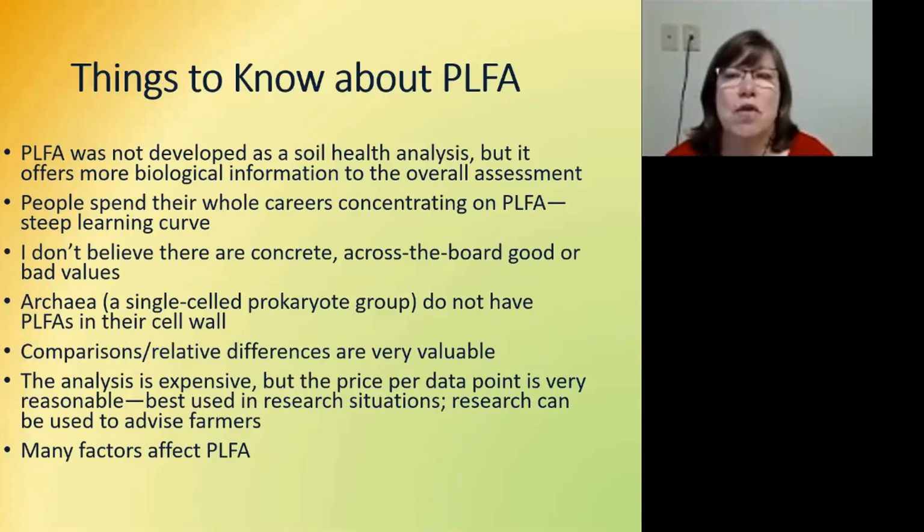Now, other things to know about PLFA. It was not developed as a soil health analysis. A lot of it was started about 30 years ago, more as a soil biology assessment. But I think there are a lot of reasons why you can use it. It does give us more information about the microbes, and through looking at it, we can learn about what is going on in the soil. There's people who spent their whole careers concentrating on PLFA, so there is a steep learning curve to it. I don't believe there's across the board good or poor values.